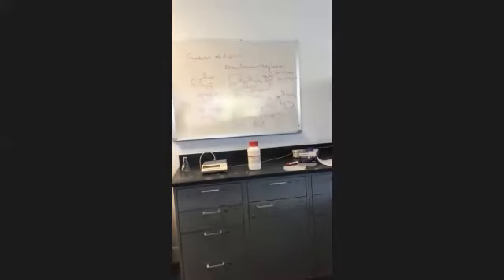Yes. Is the 6.9 the actual amount for salicylic acid? Well, no, the actual was 6.91. That's the required amount. 6.9 is required. Is the density 100?